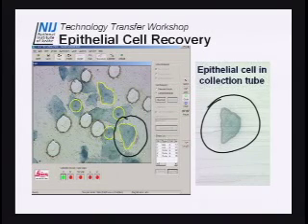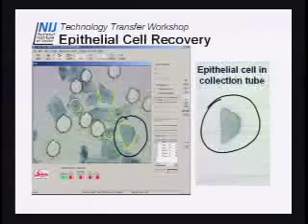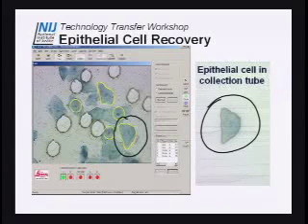Especially if you're doing low copy number work, when you do a lot of cells, you just see a cluster of cells, and you're happy that you've collected it. But if you do low copy number work and you only have 5, 10 cells, you can actually look in the tube and say, yeah, I'm confident I see them in the tube, they were collected.